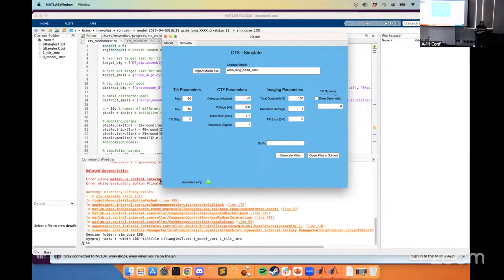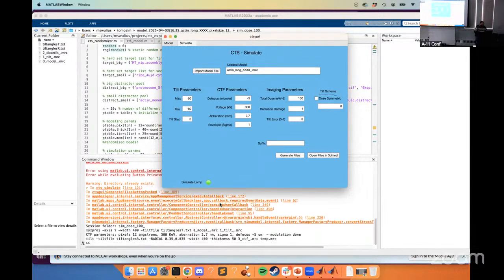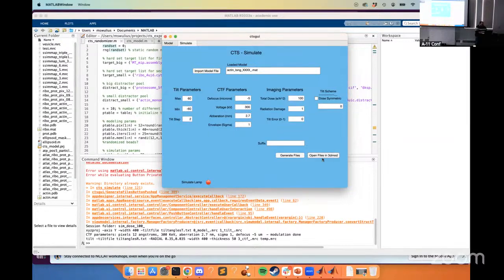Yeah, I do. It's probably gonna still get mad. Did it do nothing? What did it just do? If you did some fractions, it went to. Man, it ran for some reason. All right.